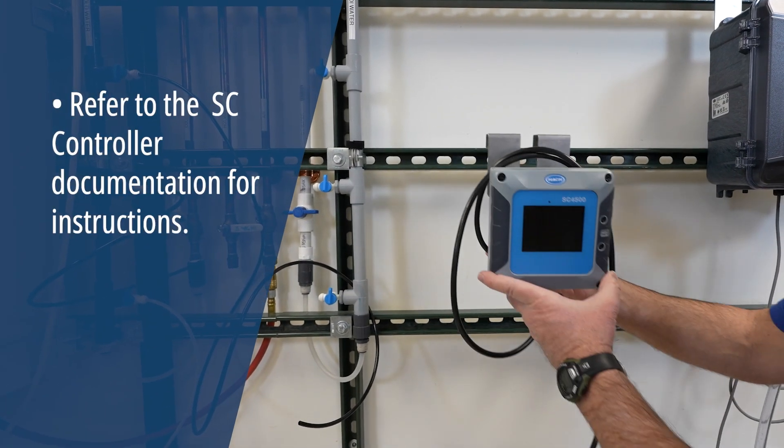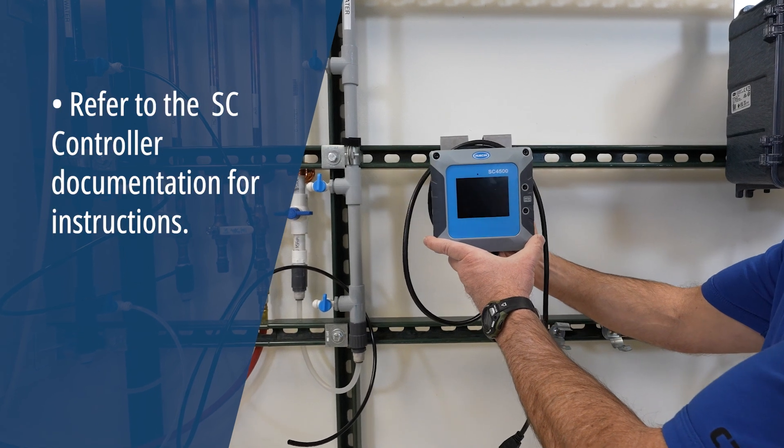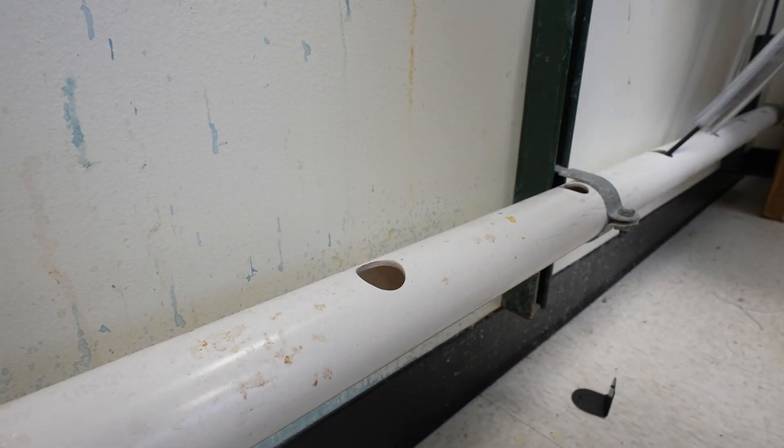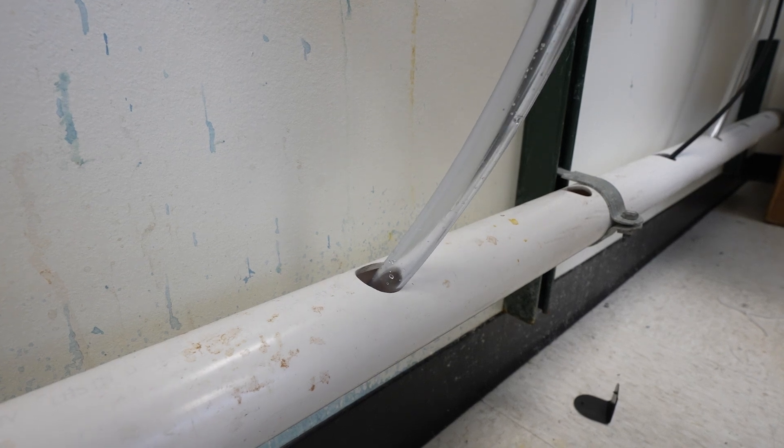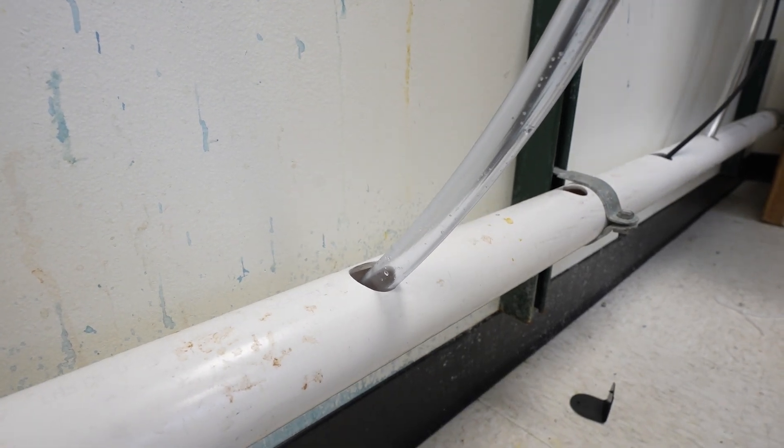Attach the controller to a wall, panel, or pipe. Install the analyzer near an open drain, where the analyzer drain can be routed with a continuous downward slope.